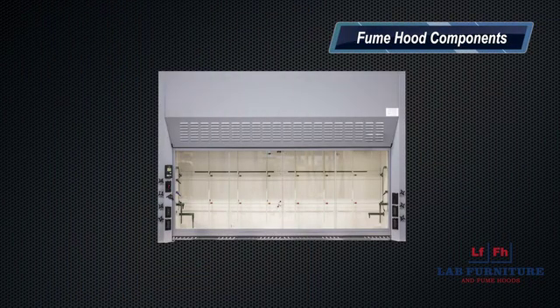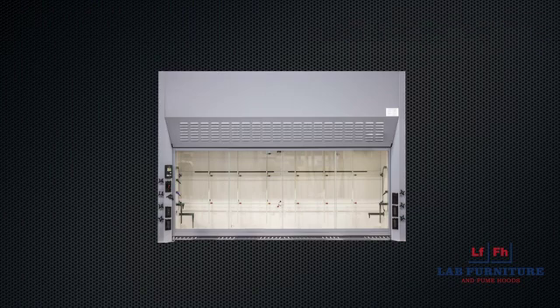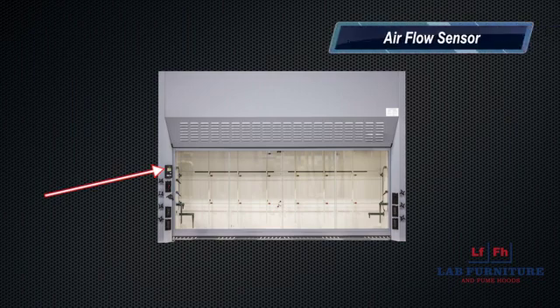Now let's quickly overview the fume hood components. Remember, all fume hoods are built uniquely, so check the components on your hood. The airflow sensor is a very important piece of equipment that monitors and measures the airflow through your fume hood. This is to be calibrated in the field. When your airflow goes above or below the set parameters, an alarm will sound to alert the user of this situation.